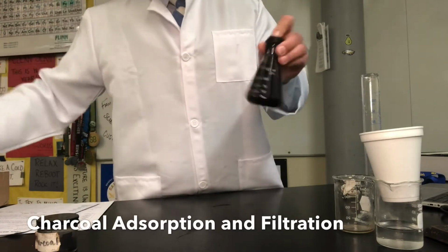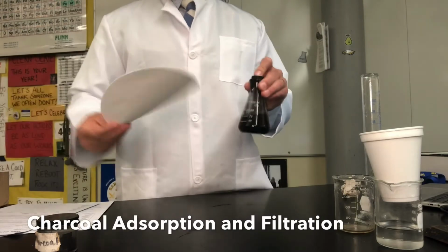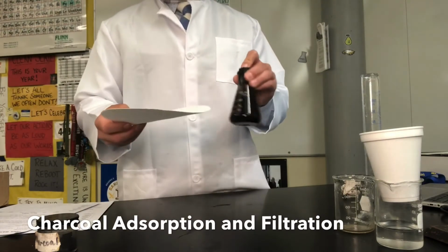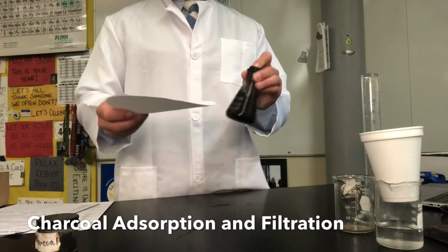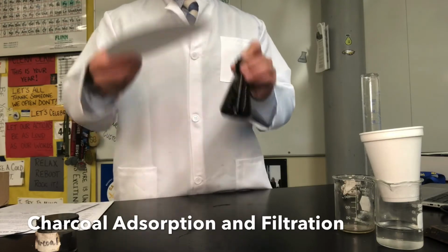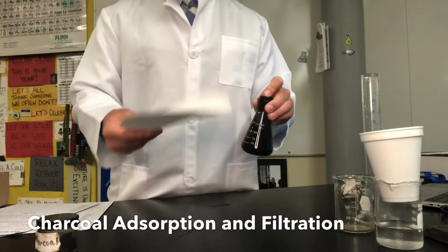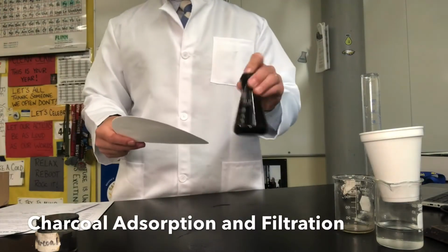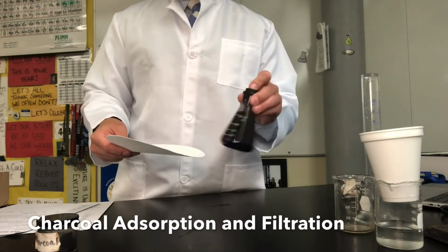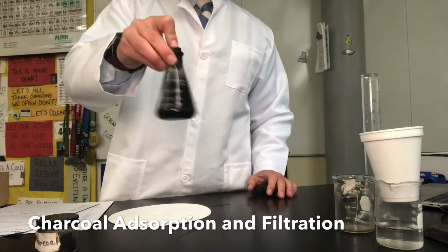And to do that, notice I'm still shaking it, trying to interact the charcoal with the impurities. We're going to take filter paper. If you think of how coffee works, you put a coffee filter down, you pour hot water over the coffee, and what comes out? The coffee grounds stay behind in the filter, and the liquid comes through, so you get your delicious hot cup of coffee. All right? Well, that's what we're going to do, but with science filter paper. So I'm going to shake this a little bit more, and I'm going to set up my filtration system, and we can go from there. But let's take a break so you don't have to watch me shaking this for a couple minutes.